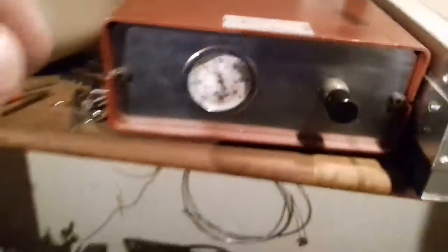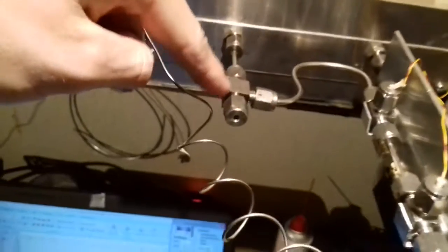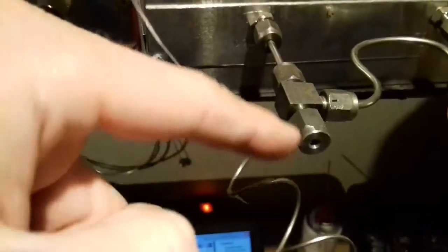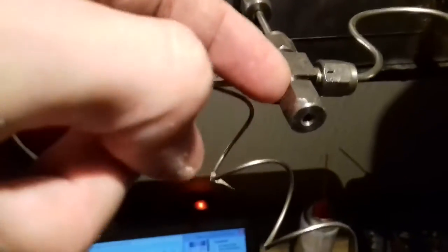And that then runs through the reference side of my detector and into the inlet. The inlet is just a T-fitting with a rubber disc called a septum. And that then runs into the oven through these bulkhead connectors.